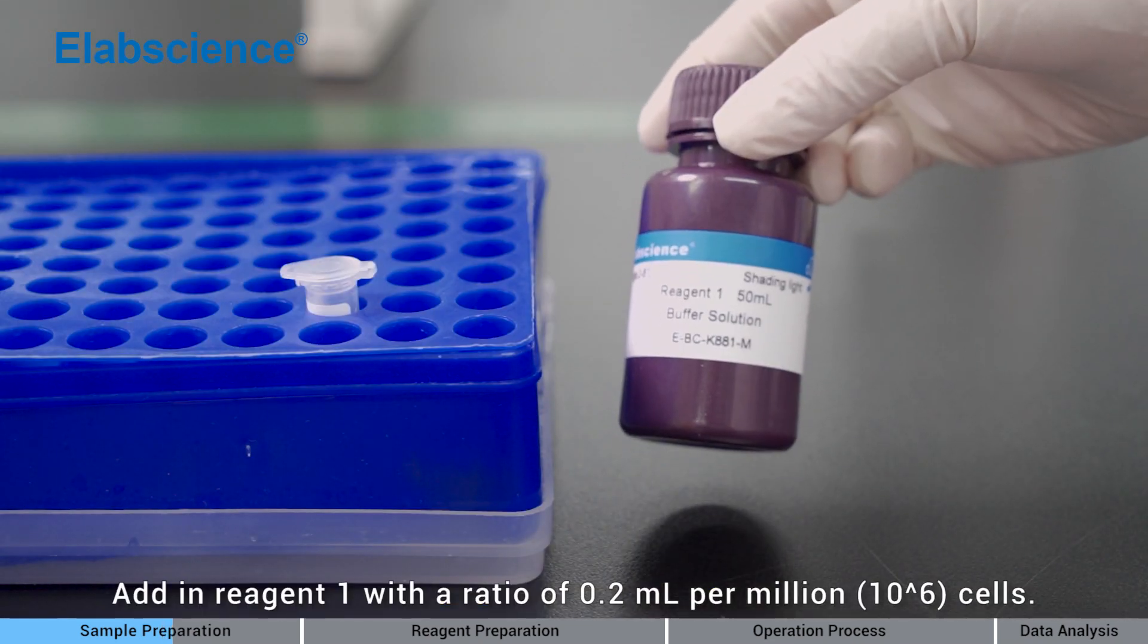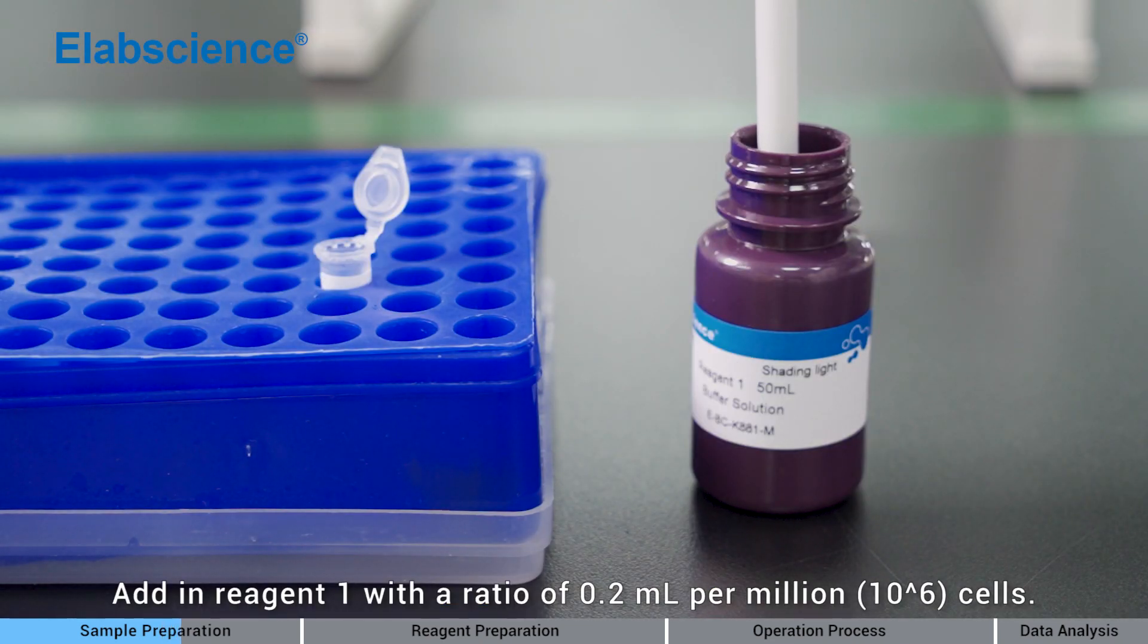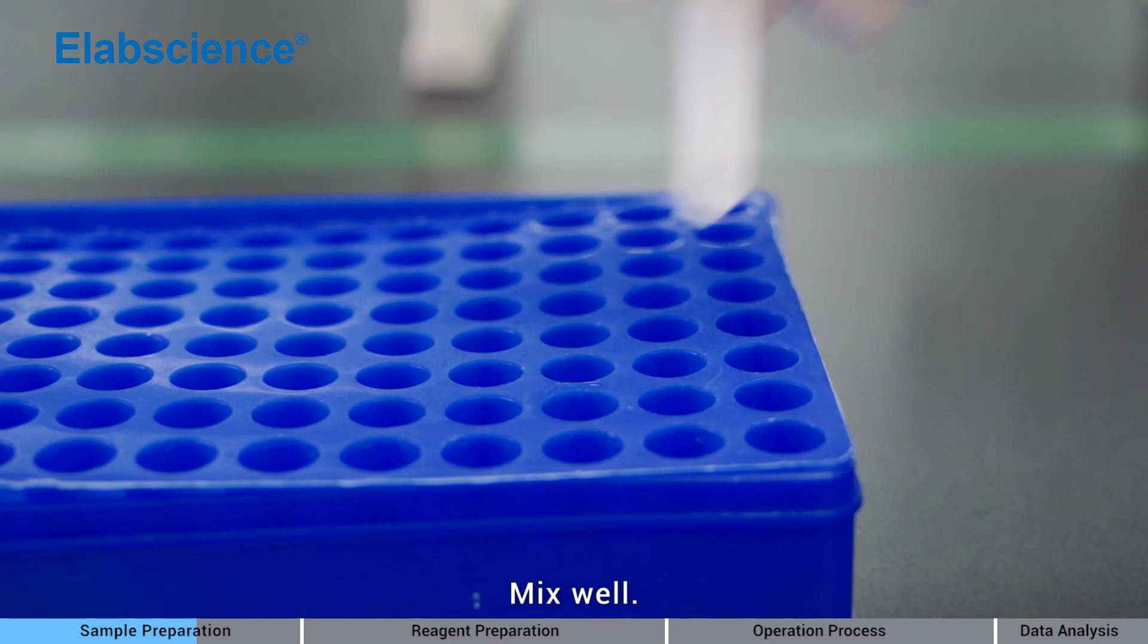Add in reagent 1 with a ratio of 0.2 ml per million cells. Mix well.